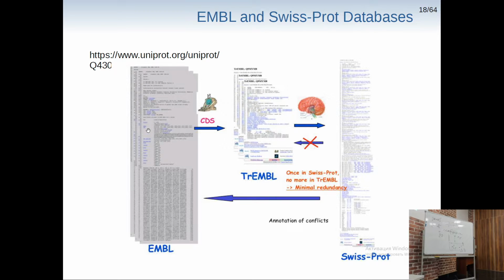Unfortunately it's done algorithmically, it's not a human who does this. All coding sequences are extracted in this TrEMBL archive. So it's just a presentation which contains only coding sequences, which we can use in our proteomics work, but still there's everything. But it is easier because we have shorter sequences. Also, after some manual curation and after having some proof that it's not just a coding sequence, but there is some protein or peptide or some other product, it gets to the SwissProt database and it is converted into an amino acid sequence, which we want to use a lot.